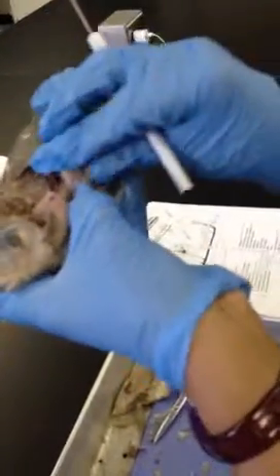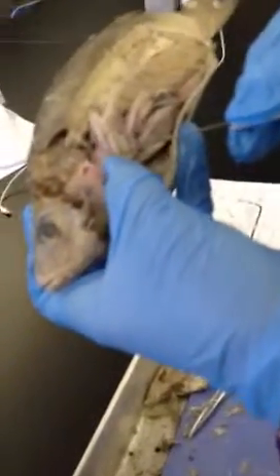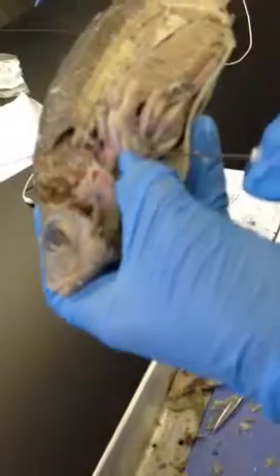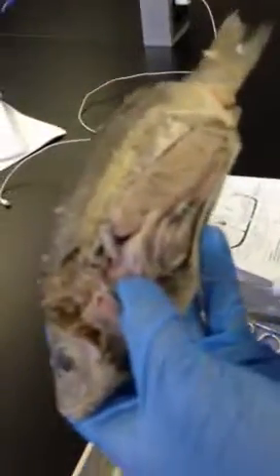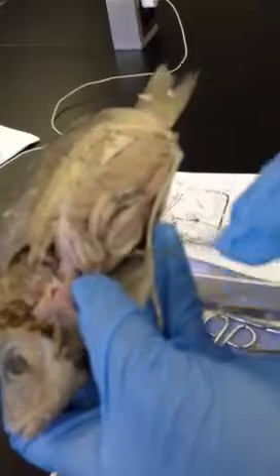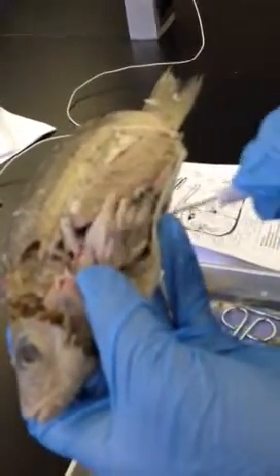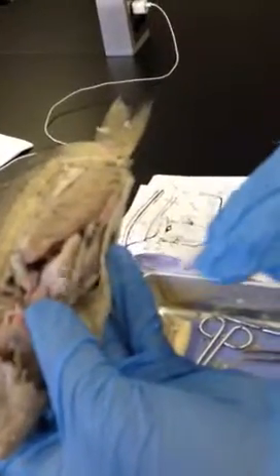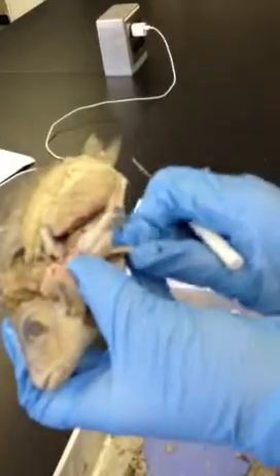Right here, I forgot the name of this portion, which is where the intestine actually starts. But I know these are diverticuli. The duodenum? Yes, this is the duodenum, right here. That's where the intestine really starts. Attached to the duodenum are the diverticuli, 1 and 2. This is the spleen.